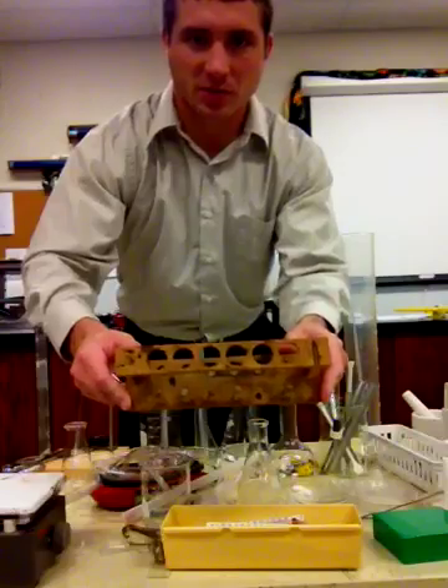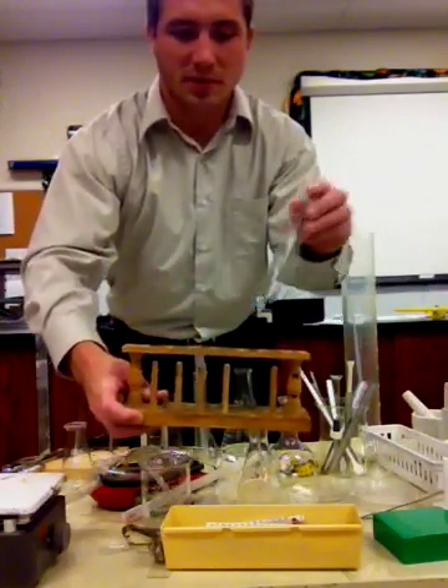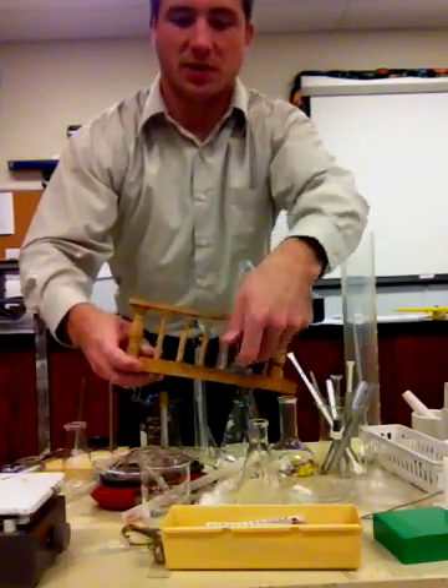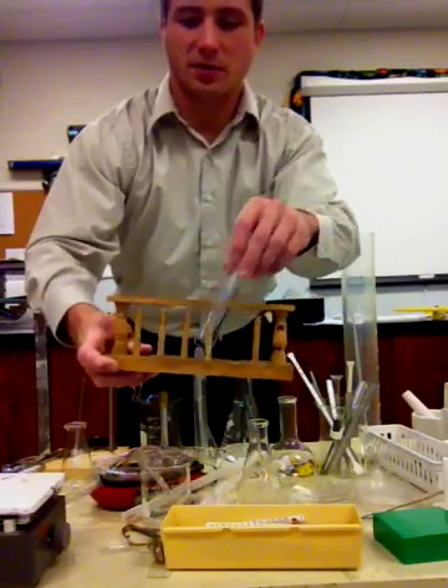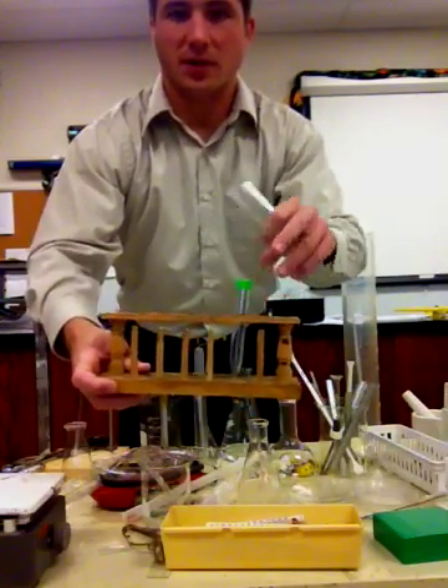Here is a test tube rack. As you can see, if I find a test tube I simply could set the test tube upside down to dry on it, or some of the test tubes will actually fit in the holder.